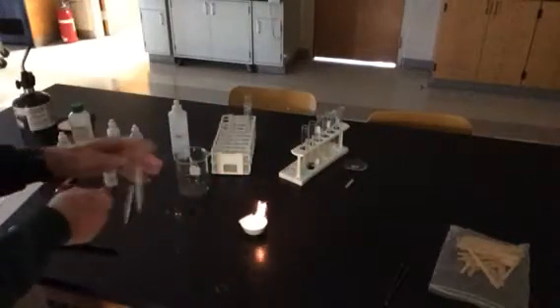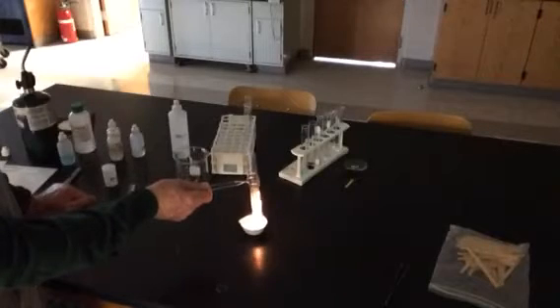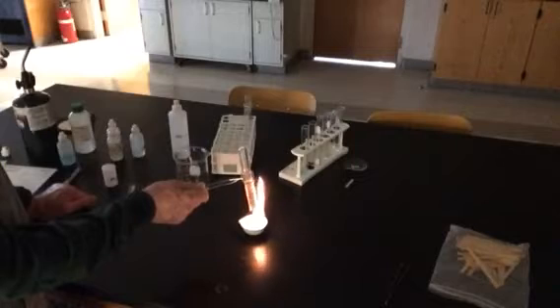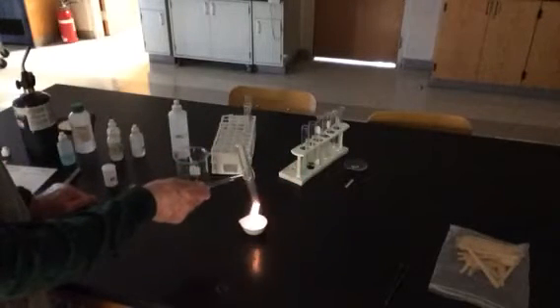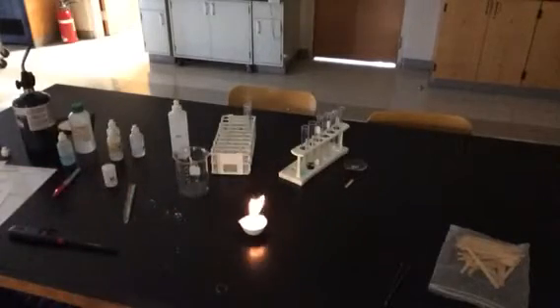Since we do have the reaction going on for a longer period of time than I would have thought initially, let me hold a test tube upside down and see if we can get evidence of moisture being produced. And yeah, I think I do see it here. So let me turn the lights back on so that you can see.